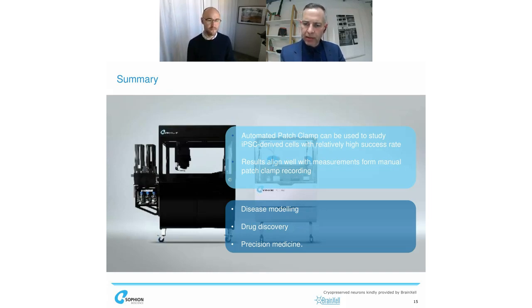Okay, and on to the next question. You was asking, what's the percentage of neurons in the cell suspension? For instance, from the last talk, he was saying often that the culture is mixed with glia and neuron. So what kind of percentage of neurons in the cell suspension are you getting from a potentially mixed population in culture?